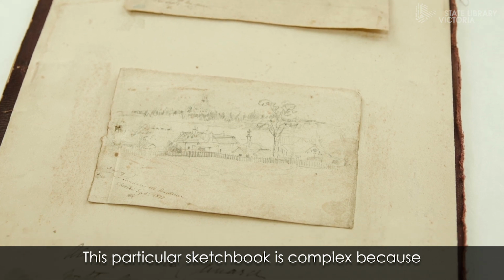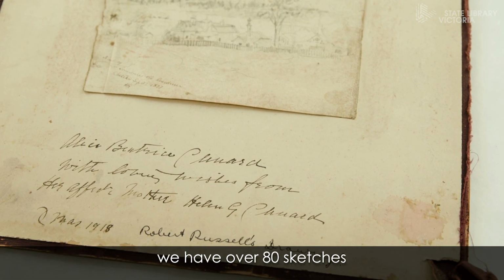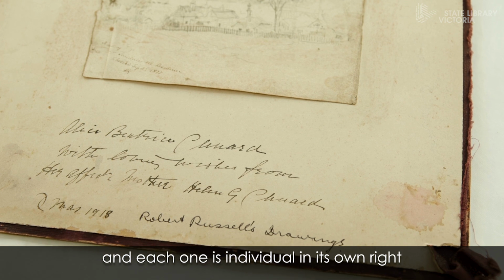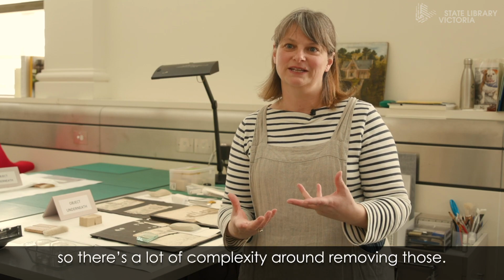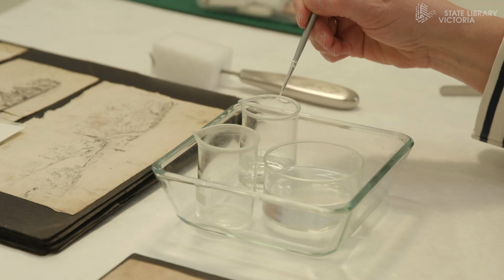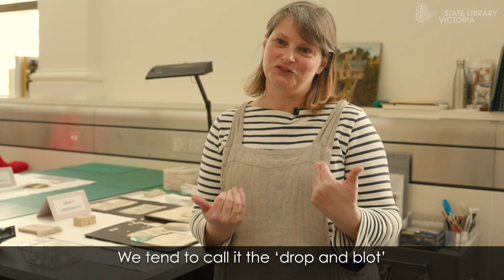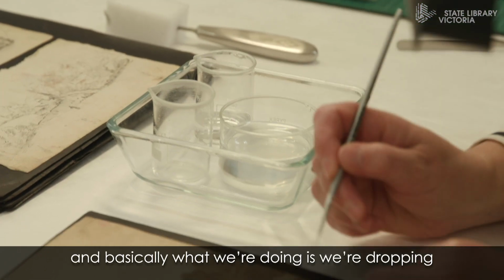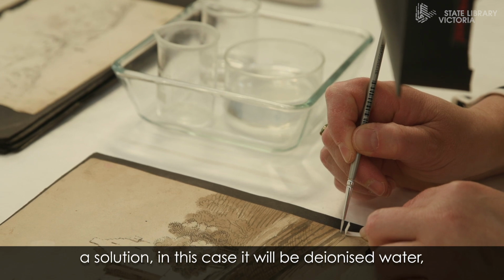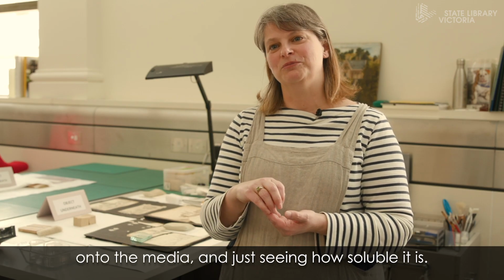This particular sketchbook is complex because we have over 80 sketches and each one is individual in its own right. So there's a lot of complexity around removing those. So the first thing we do is we want to look at solubility. We tend to call it the drop and blot, and basically what we're doing is we're dropping a solution, in this case it will be deionized water, onto the media and just seeing how soluble it is.